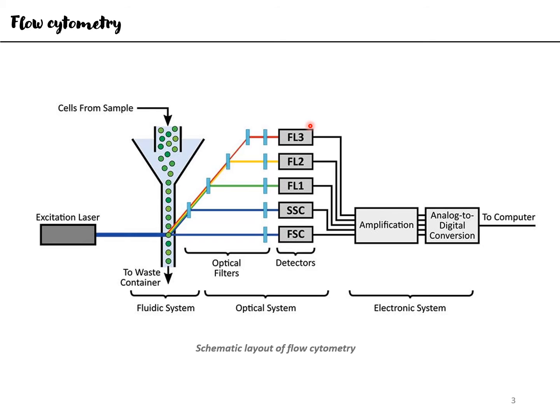Right. So let me break that down. Let us assume that your population has several cell types, and there is type 1 which expresses only epitope A, type 2 which expresses only B, then there is a type 3 which expresses only C. Now you can also have subtypes which express a combination of these epitopes, like say for instance a type 4 that expresses A and B, a type 5 that expresses A and C. So this system is sophisticated enough to distinguish between or among these individual cell types.